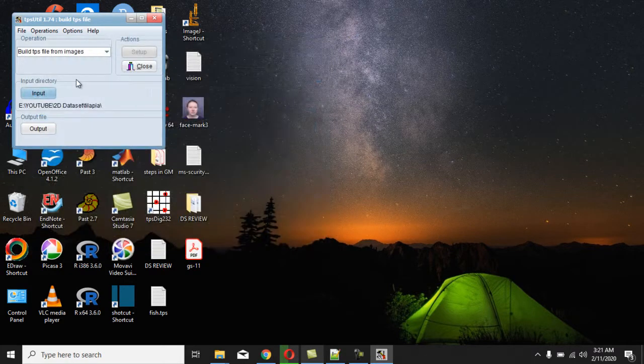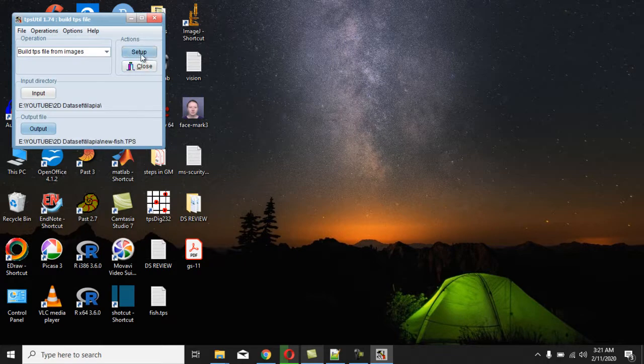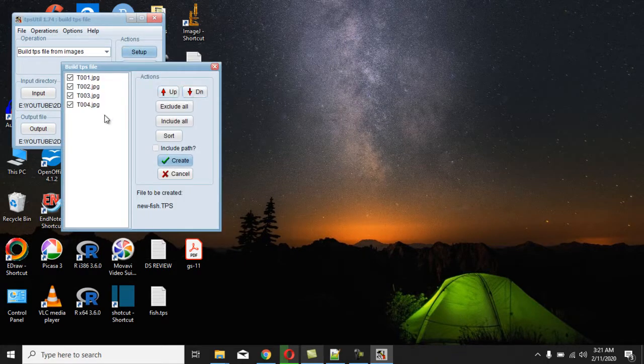All right. So now, where do you want to save it? I want to save it here also. So let me give it a new name, new fish. So just click on save. So now click on setup. So automatically it will display all the images.